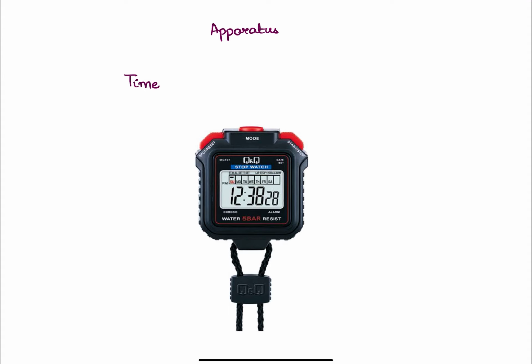In this video, we're going to see the apparatus which are used in the laboratory for the measurement of time, temperature, masses and volumes. Let's first look at time. In the laboratory, the most used apparatus to measure time is a stopwatch.